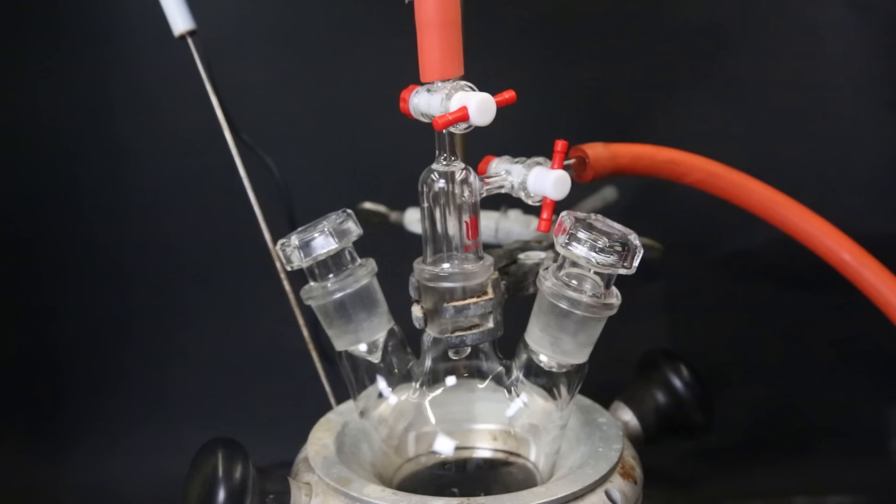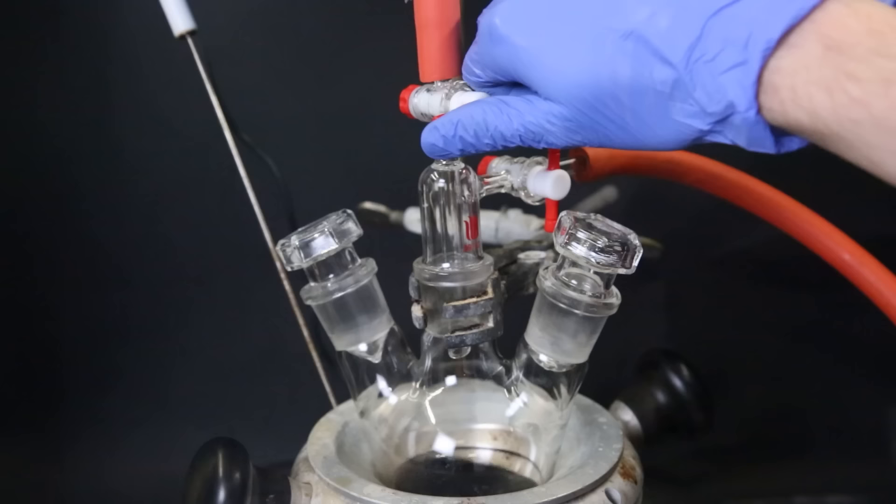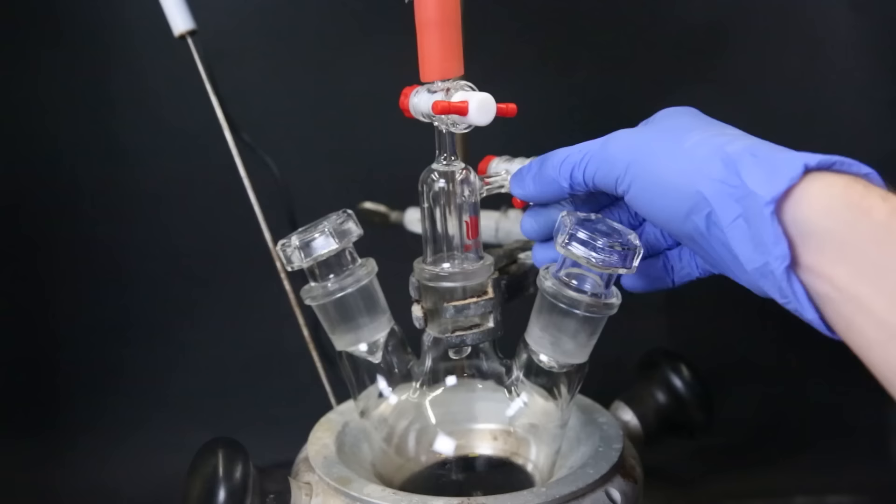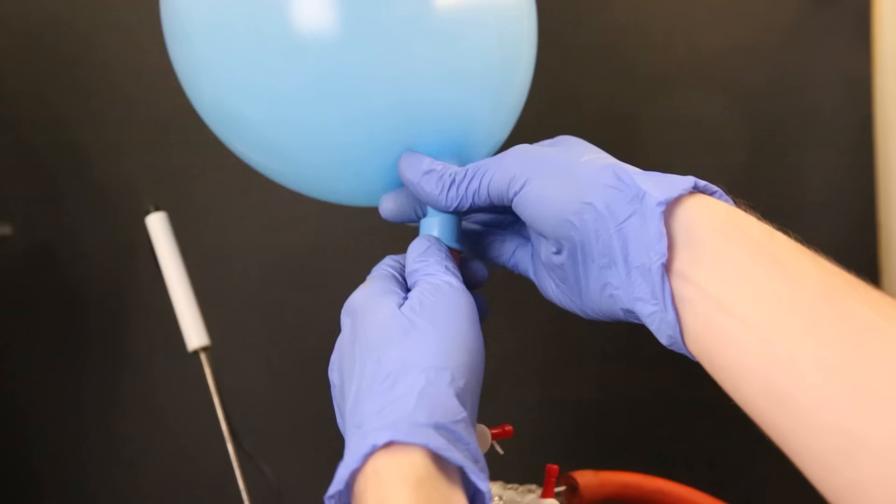So I open the way to the vacuum pump and remove all of the air from the setup. Then I close it off and there is now a slight vacuum in the setup. So now I can open the way to the balloon which will cause the pressure in the balloon and the setup to equalize. So the argon from the balloon will quickly rush into the setup and fill the atmosphere inside. This process is one purging cycle and is done three times to make sure all of the oxygen has been removed. When that is done, I can move on with the next step.